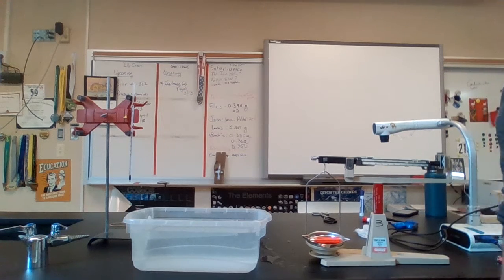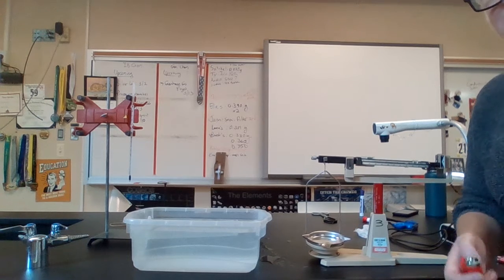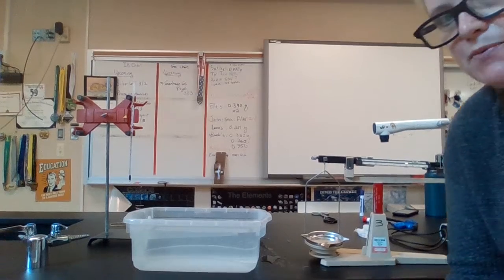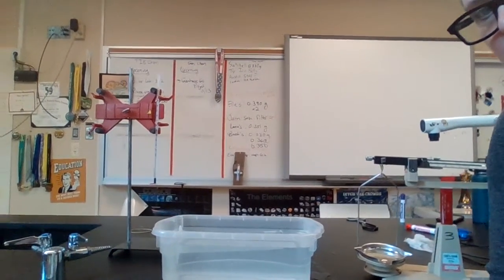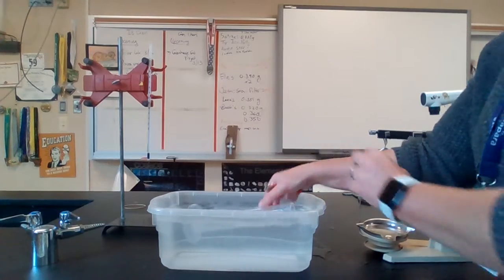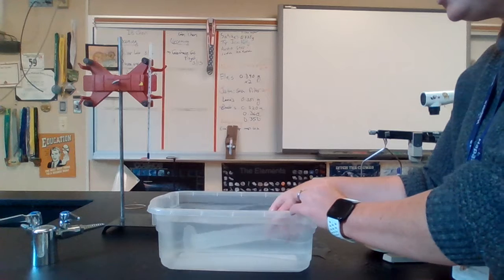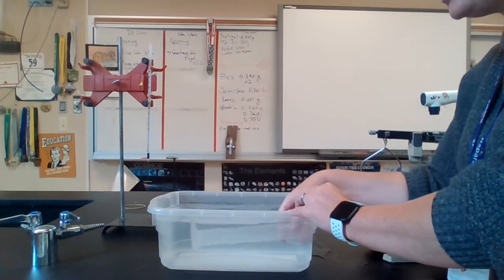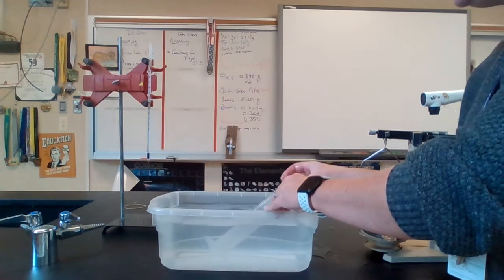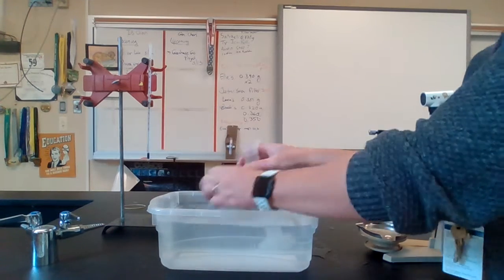Okay, so I'm going to collect some gas now. In order to collect this gas, we're going to do the water displacement method. And I hope you can see this when I zoom this in. It's really similar to that lab that we did where we separated hydrogen and oxygen in water, and we did water replacement to get the hydrogen and oxygen gas.